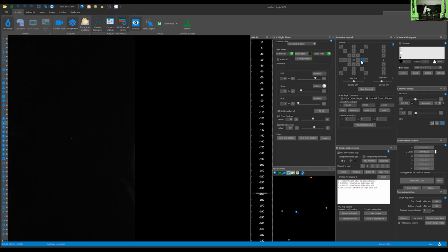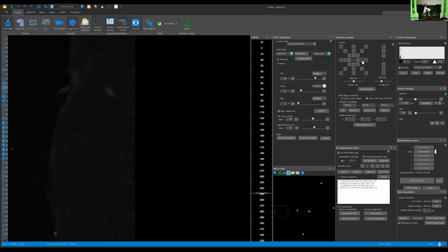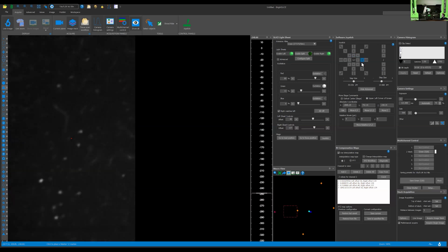But once I have the widest extent of my mouse brain, I could actually take a marker and drop it there and return to it later when we're actually setting up in the workflow. So as I'm exploring my sample, I like to drop markers wherever I am, just so that I can return to them and it helps me start delineating the sample.